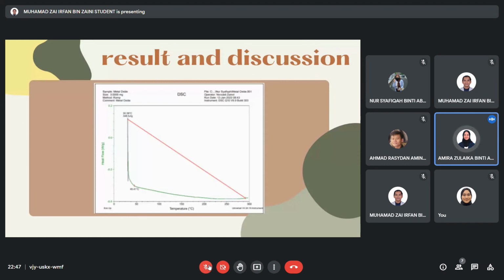At 45.41 degrees Celsius, a strong peak appears, indicating the sample melting point owing to an endothermic heat reaction, and its heat capacity at this temperature is zero. An endothermic process also causes a significant negative baseline change from 30.38 to 300 degrees Celsius.